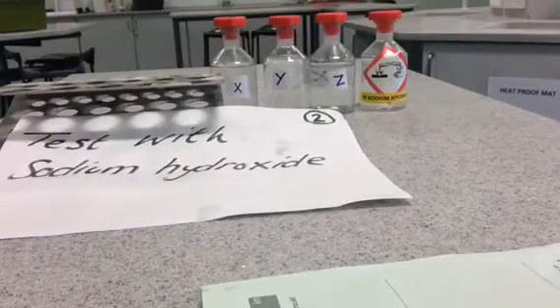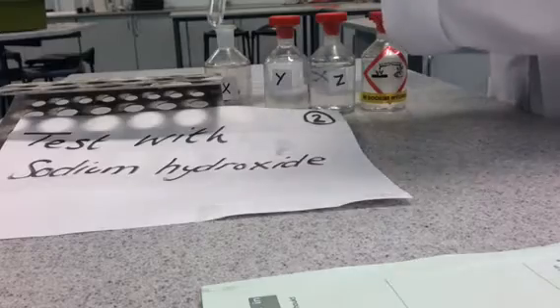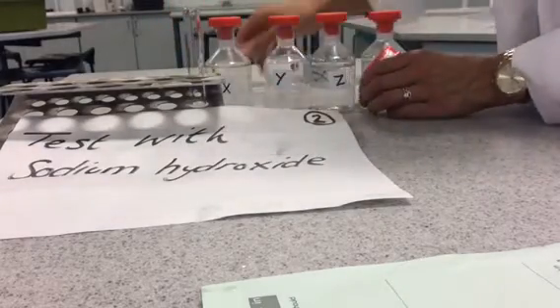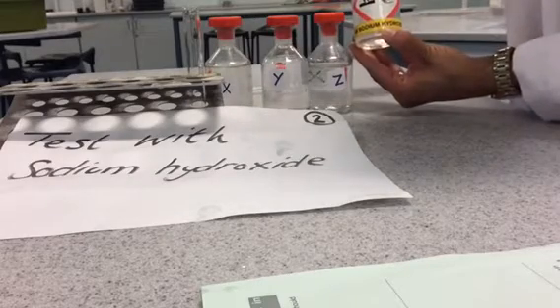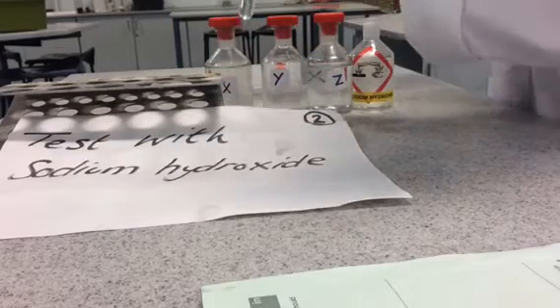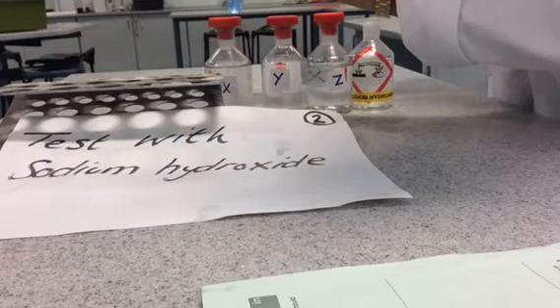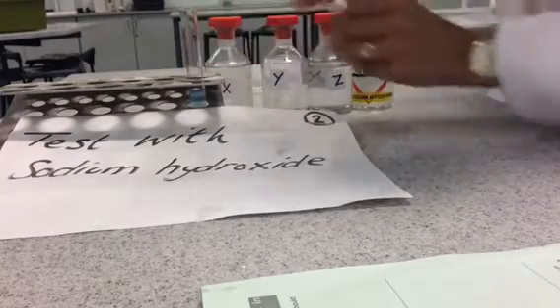Test with sodium hydroxide to identify metal ions. Take one centimeter cubed of your unknown ionic compound and place that into a test tube, then add one centimeter cubed of sodium hydroxide solution. If the reaction produces a colored precipitate, you can identify the metal ion from the color of the precipitate. Repeat with the other two ionic compounds.